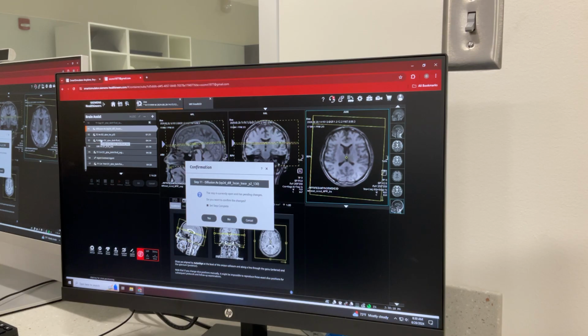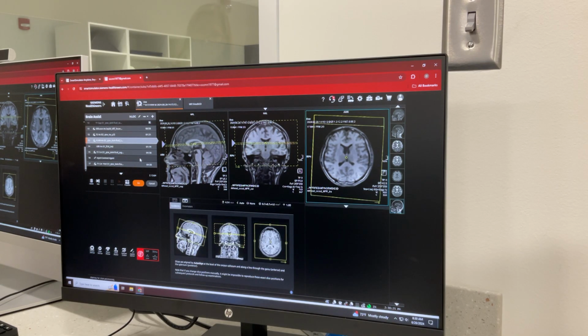So once you already have one open, it's not going to let you open another one. Whenever it's grayed out like this and has that arrow, it means you didn't plan it, so I would hit no. Now, I would drag this one up.